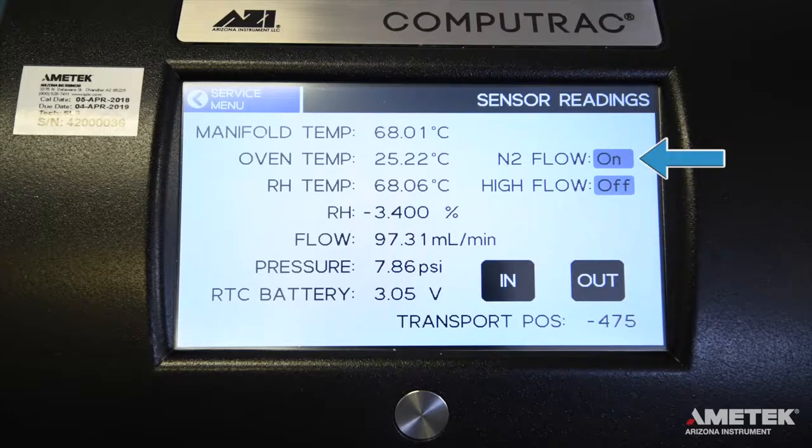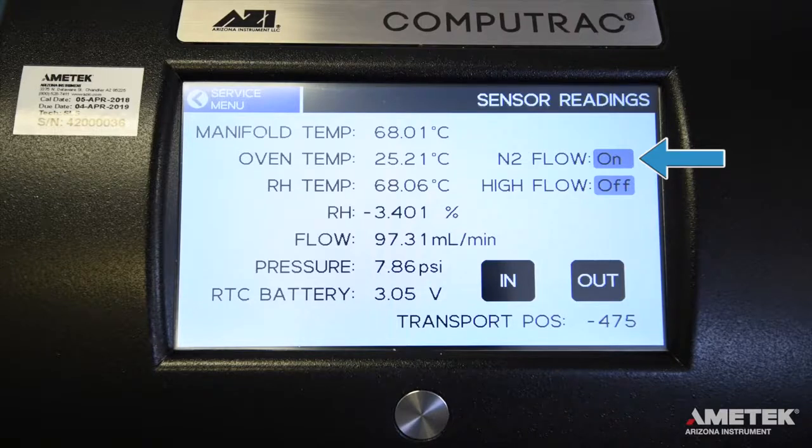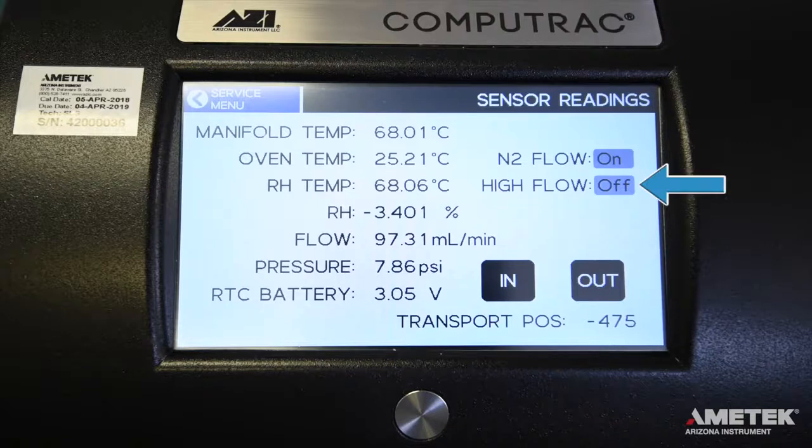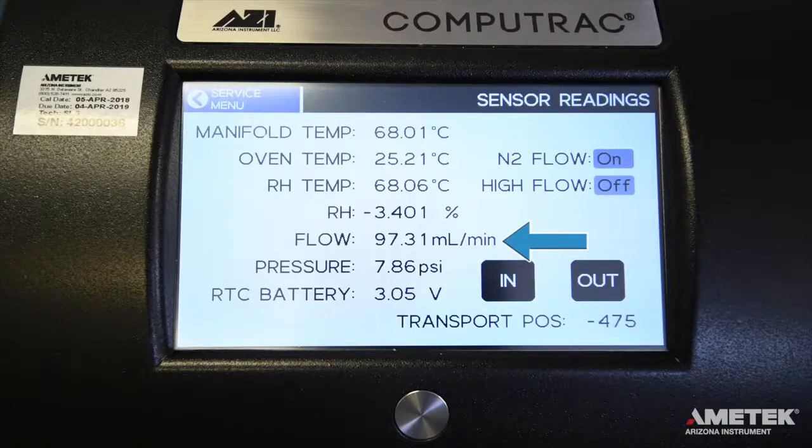N2 flow is on. This represents the carrier gas flow and is applicable whether you are using nitrogen or compressed air. High flow is off. Flow is 95 plus or minus 5 milliliters per minute. Touch the gray area next to N2 and high flow to toggle them on or off if needed.